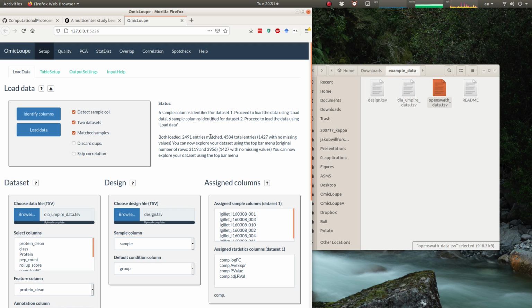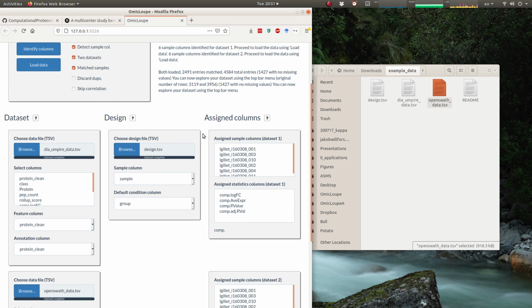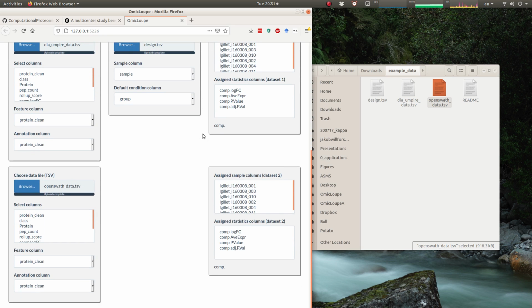But now the data is loaded and we're ready to start exploring the data, and I will show you that in another video. So with that, if you have questions and problems, feel free to reach out to me.